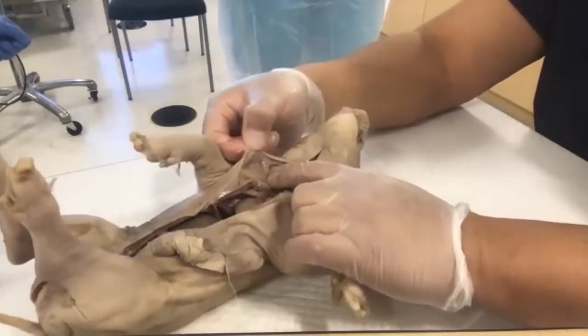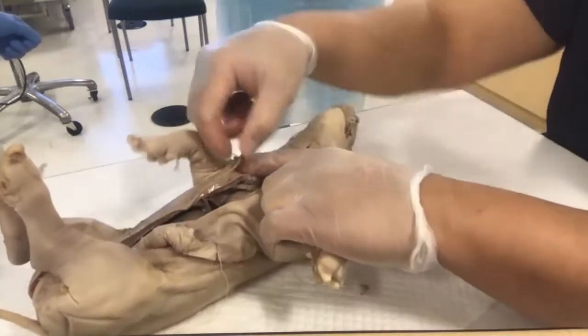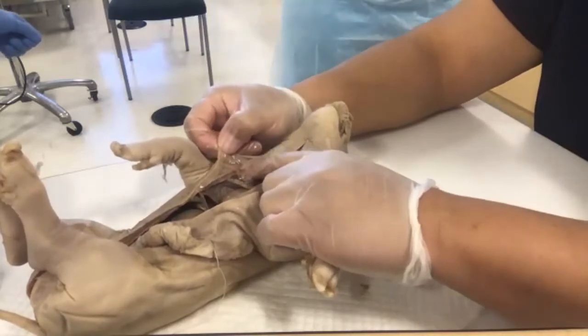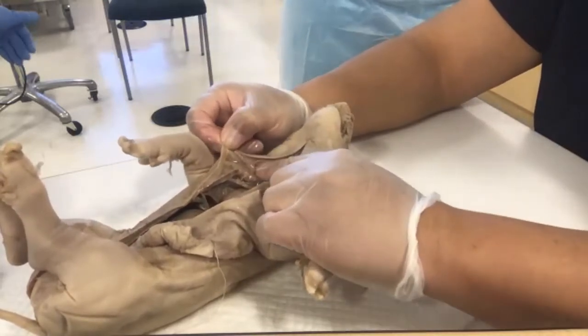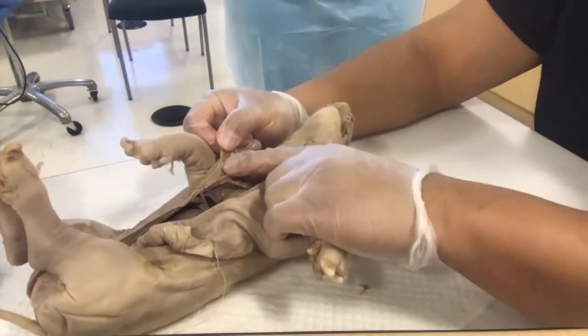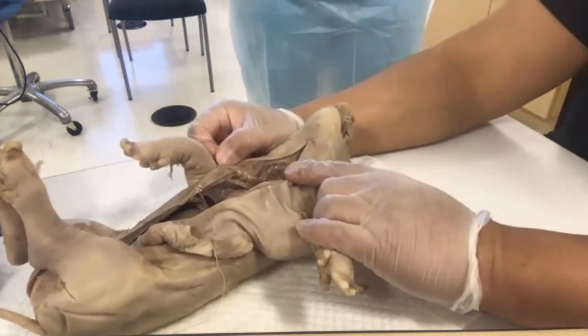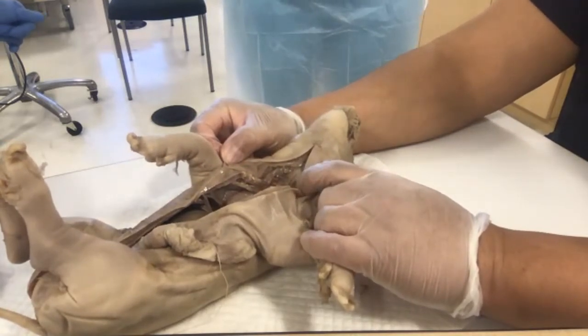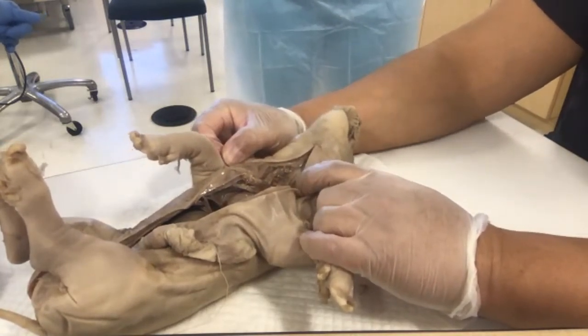Now, you might not be able to see in the video, but for those of us here in lab, can you see here, on the inner layers? There are little arteries and veins you can see. See that? Now, if you see an artery and vein next to something that looks like a whitish, yellowish hair, that's a nerve.